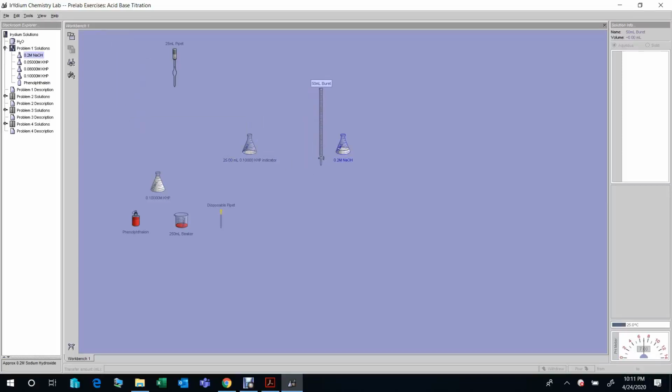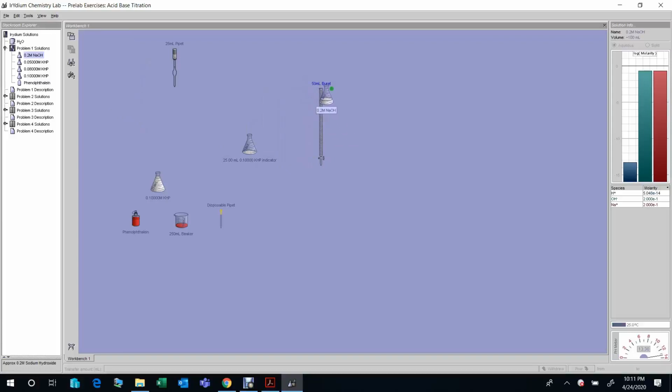And then we can first transfer this solution to here. You see it shows green light. Then we can do that, but we need to be very careful because remember, when we transfer solution this way, we use our hand, and our hand cannot control very well.